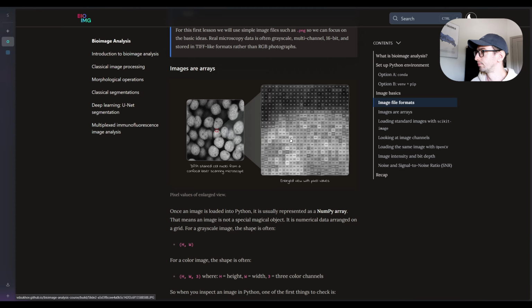For example, we can bleach it and find details that are not visible in the color version. Okay. We can take some sigmoid function looking graph to increase contrast. For example, yeah. But basically, the idea is that you can use whatever you want, and the beauty of images usually is that any operation that you have in your mind, you can right away test it against your image.